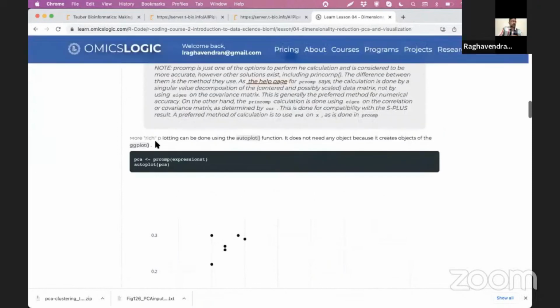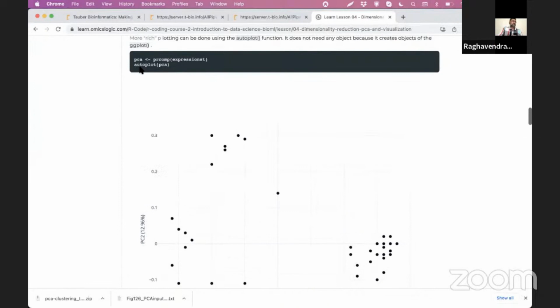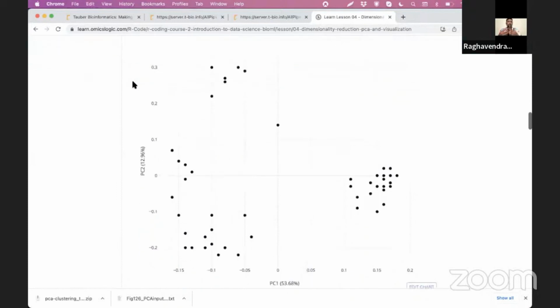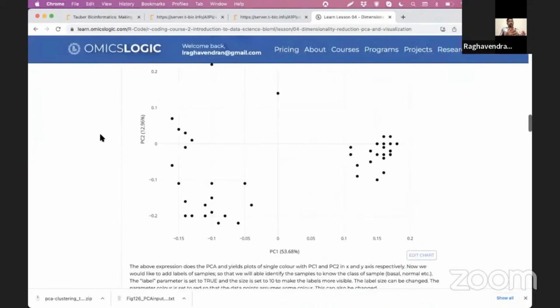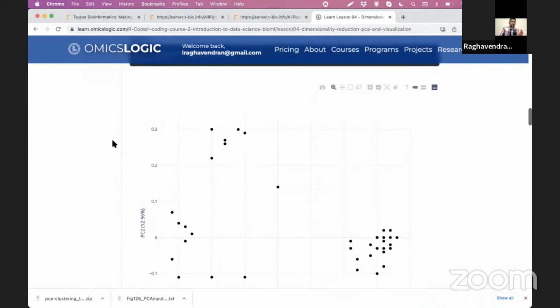So just like using plot, we have another way of interpreting the PCA, which takes the ggfortify library, and autoplot is that function. That function comes with the added advantage of having some presets that are very useful to us. Like, it takes the percentage of variance explained by principal component 1 and principal component 2 automatically, without the need of explicitly defining it, and it produces some really nice, appealing graphics.